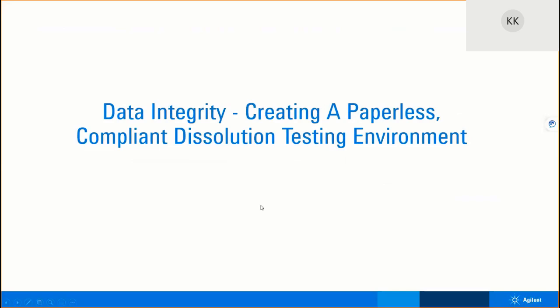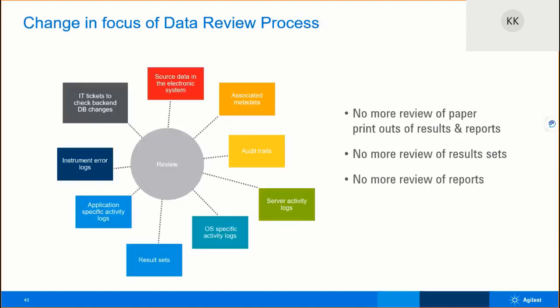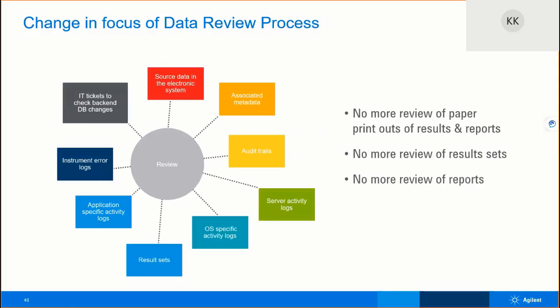So further on from this, we're coming to another interesting topic, and that is data integrity. So creating a paperless compliant dissolution testing environment. So really the question here is, is data integrity a new regulatory expectation? Of course not, right? But the FDA certainly has changed the focus of data review processes.